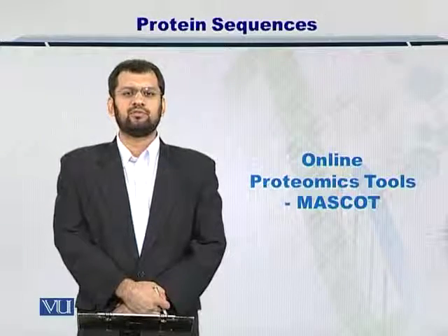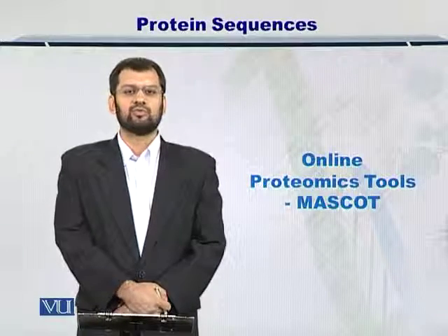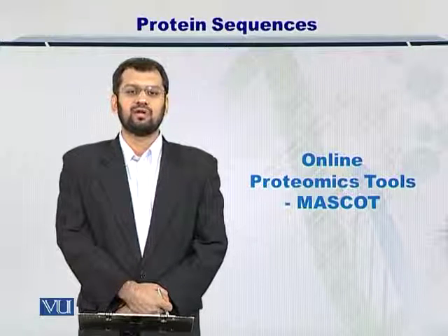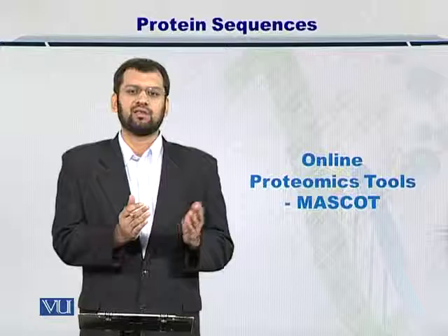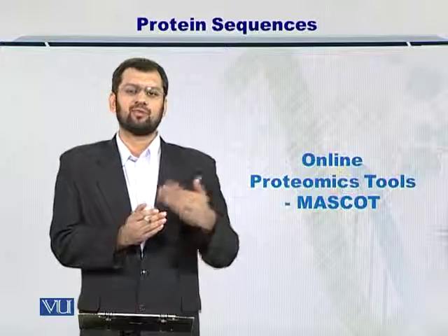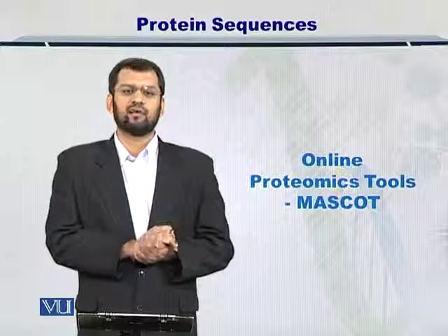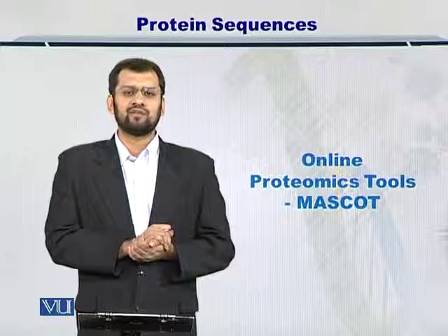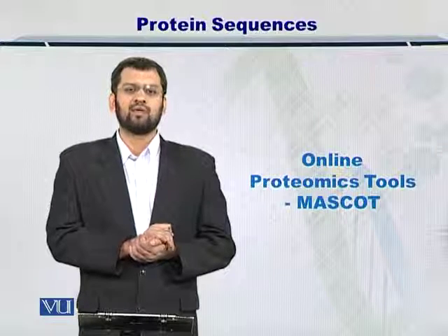Dear students, there are several proteomics tools available online which help you to search your mass spectrometry data that is reported from the instruments, either in the raw file format or in the MZXML or MZML, mz data file formats. So let's take a look at the first one, Mascot.